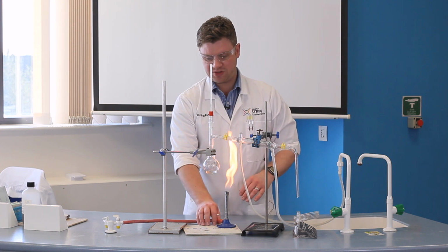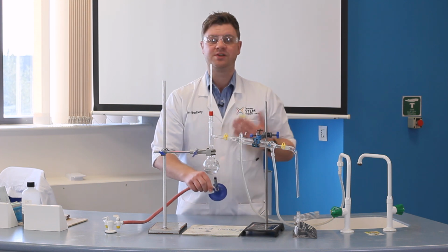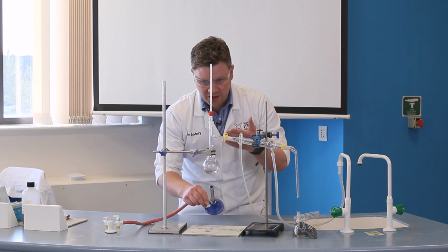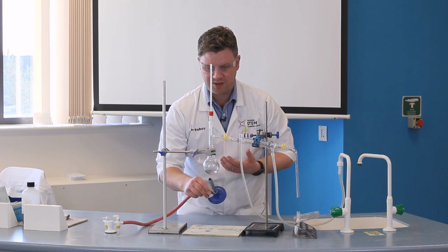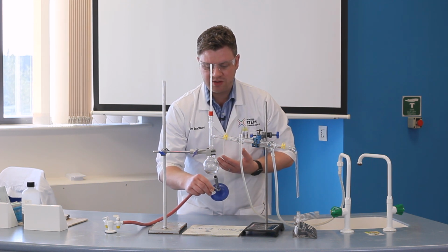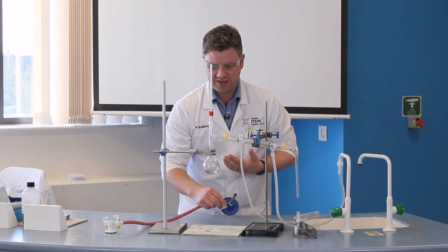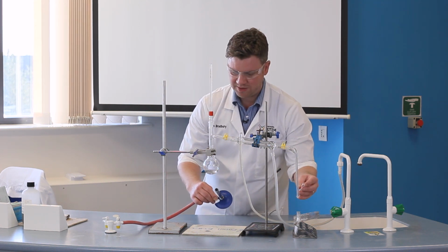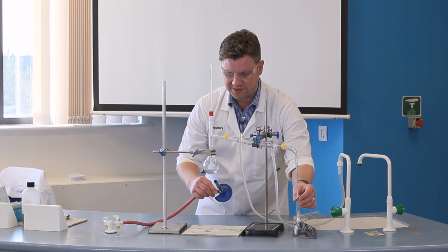And we are going to start by gently heating our synthetic crude oil in the round bottom flask. And all the time that we're heating that, we're keeping an eye on the thermometer, making sure that we're just bringing that synthetic crude oil up to temperature to separate off the first fraction. So gently heating, and then once we're there, getting ready to collect that first fraction into our first tube.